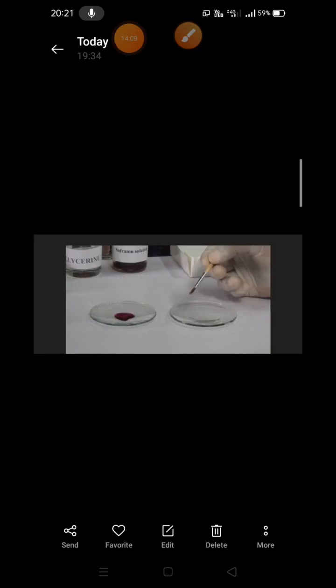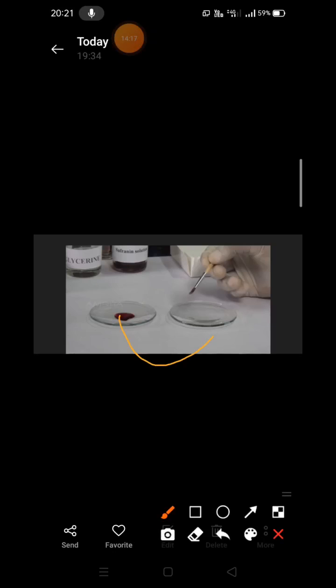Now we will take the brush and we will transfer it again into the water. Why? What are we doing? We are transferring again this membrane, this onion peel, from this watch glass which is having coloring material to the next watch glass which is having water. क्यों करते हैं? ताकि जो एक्सेस स्टेन है that is removed. So first we kept it in water so that it does not dry, then we kept it in stain so that it takes the color, and now again we will transfer it to a watch glass which has distilled water so that the excess amount of stain is washed off.